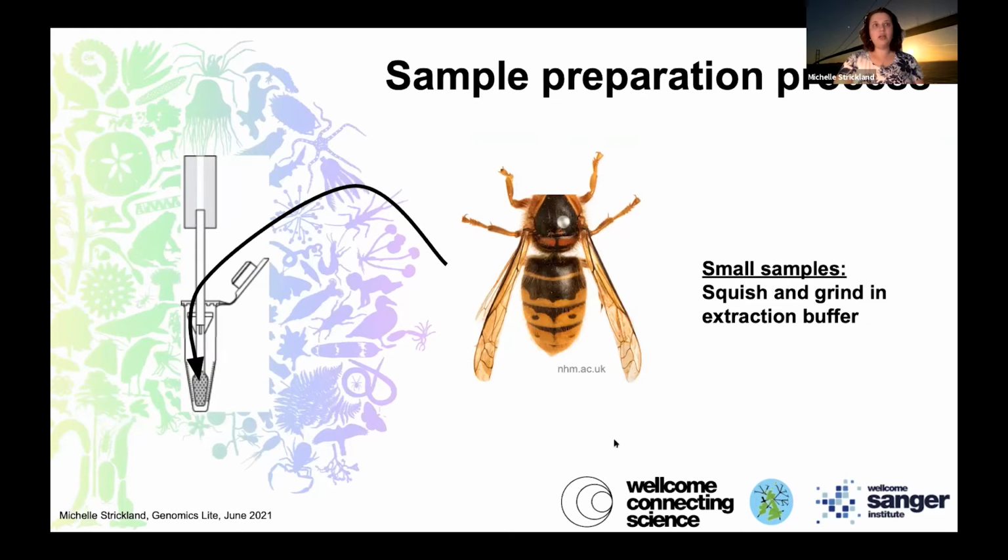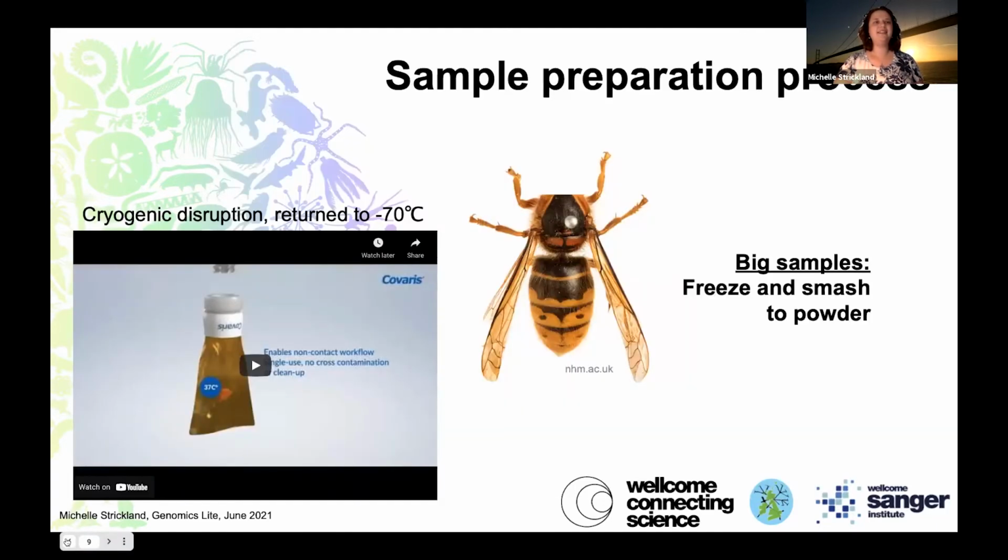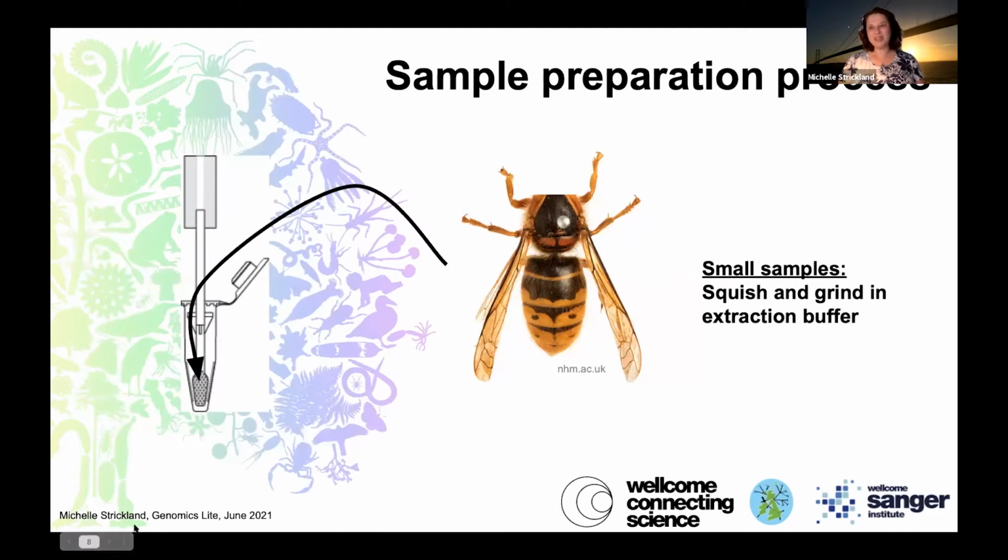It's fairly straightforward. You put lysis buffer, and this is a mixture of enzymes to break down proteins and detergents to break down cell membranes. All of that goes in this tube. The sample goes in this tube, and then there's a little pestle in there that's abraded. It's quite rough, and that just helps to rip the tissue apart and gives us the maximum surface area so we can get the most DNA out of these samples. So it's a very destructive process.